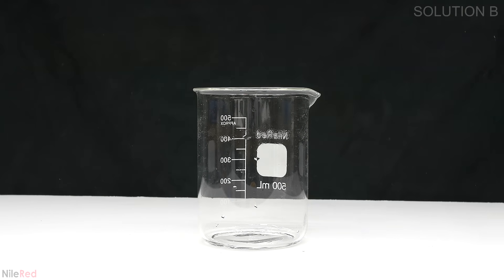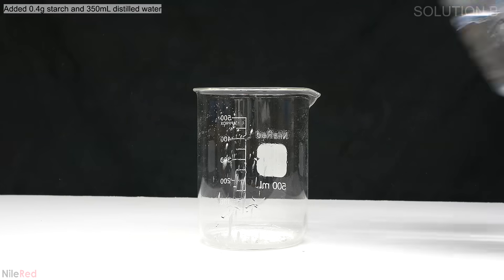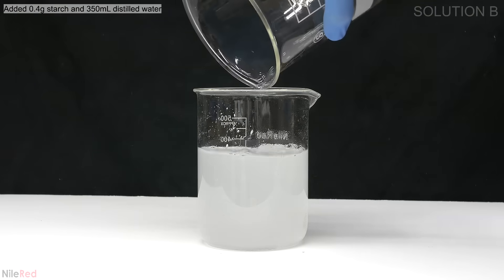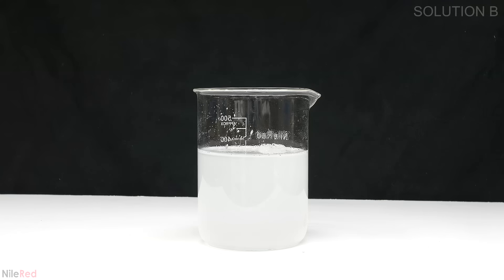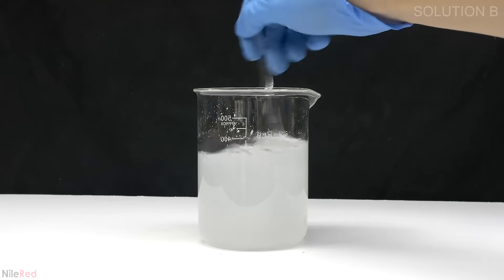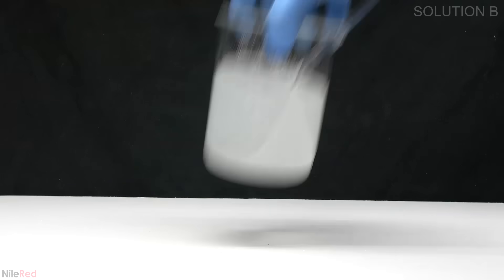The first thing that I need to do is make a starch solution. Into a beaker I add a small amount of cornstarch followed by a bunch of distilled water. I mix things up using a glass stir rod but the cornstarch isn't really going to dissolve. To get it to dissolve I need to heat it up and the easiest thing to do is to put it in the microwave.